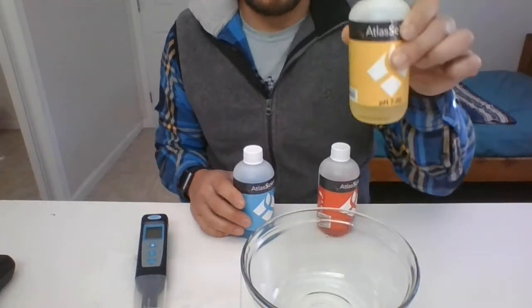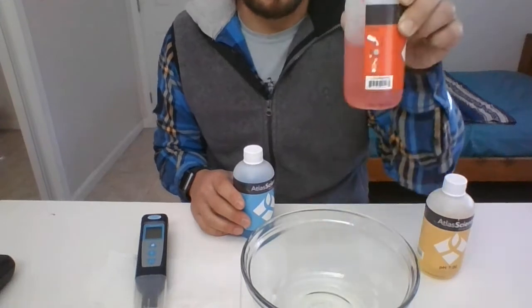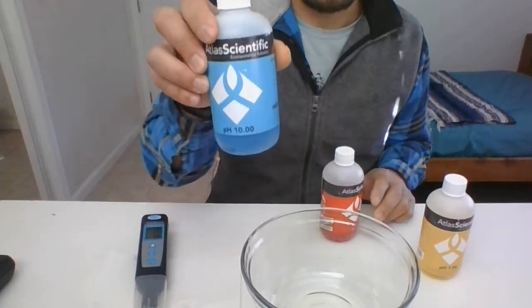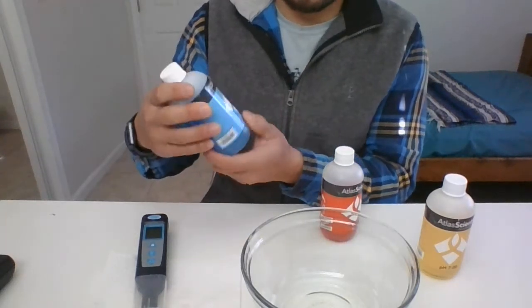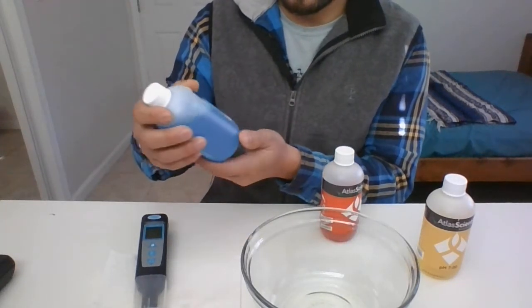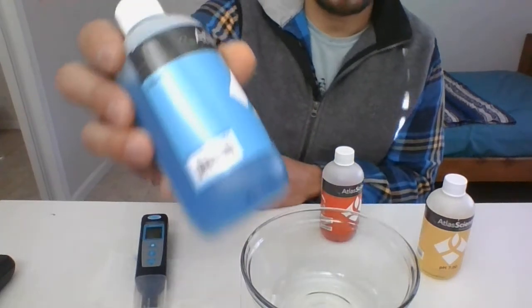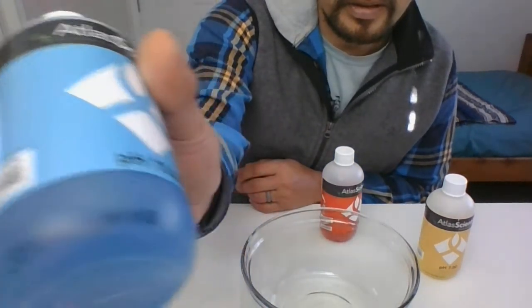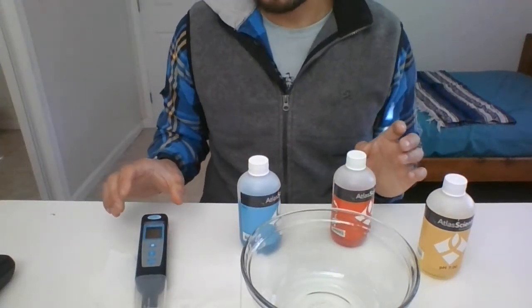You need your pH 7 buffer, which is usually yellow, your pH 4 buffer, which is red, and your pH 10 buffer, which is blue. There are expiration dates on these buffers — this one I have is for 9/4/22. So we'll get right at it.